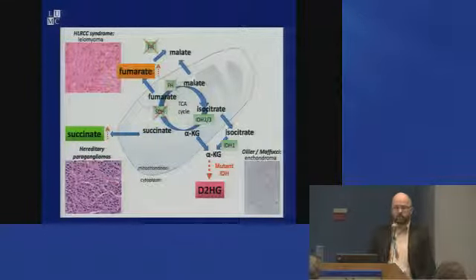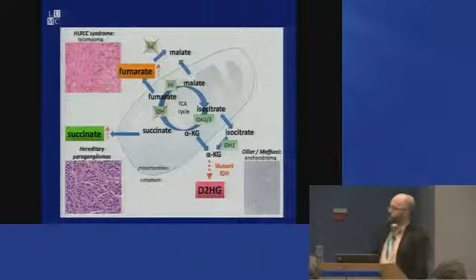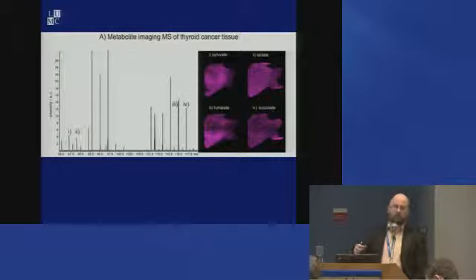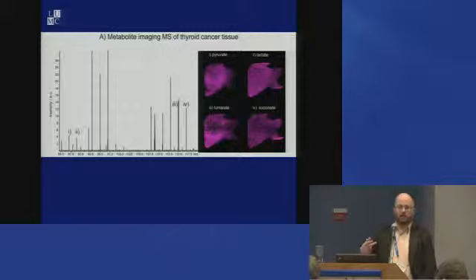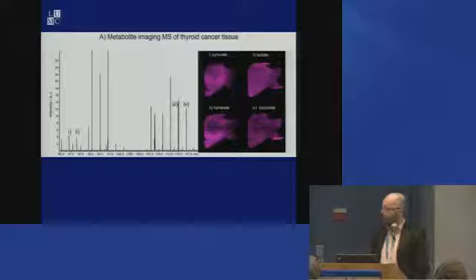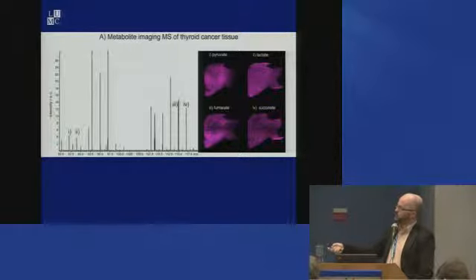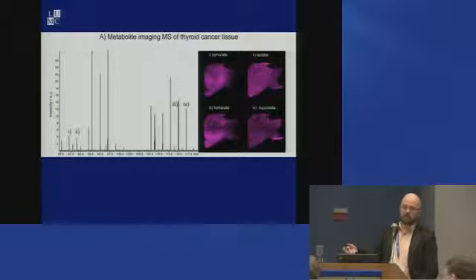And so we started testing this on the FTICR, a very high mass resolution system, and we found that we could detect these metabolites: pyruvate, lactate, fumarate, and succinate. And we used internal standards, of course, to really test that we were detecting the real metabolites. So this got us kind of excited. Okay, it looks like we can actually detect some of these metabolites. What I should say here is that this is far from straightforward to perform, because these instruments have not been designed to scan at such a low mass range. This was an FTICR.